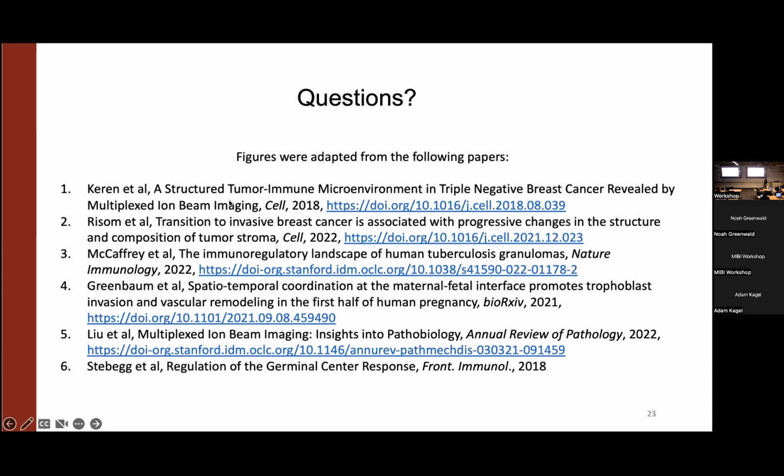I can see how it would make sense for the big tiled images that you have of the brain, but we haven't run it in this case because the different FOVs were taken from completely different locations. So it really didn't make sense to allow the null distribution to permute between the different FOVs. But if you comprise one big happy image out of your tiled smaller images and you view them as one image, then yeah, I guess that would be a good option as well.